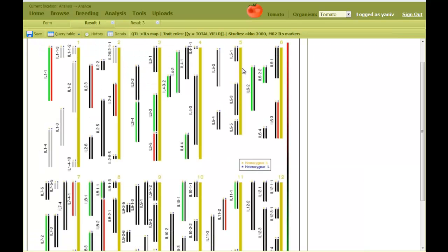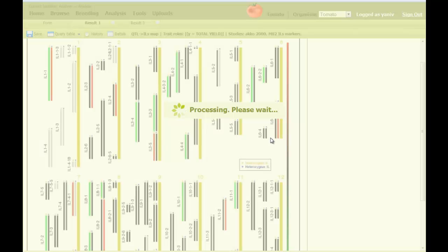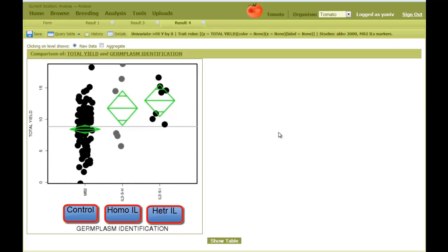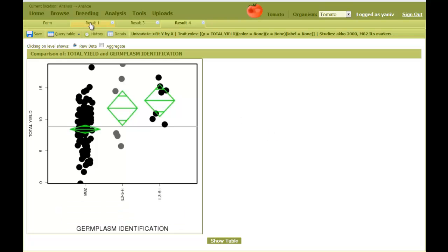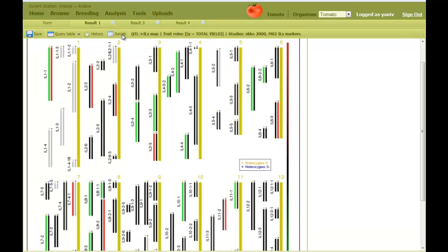Going back to the figure, I can click on the integration name to put the homozygous, heterozygous, and the control on the same figure. Finally, I can click on a chromosome to see all lines that correspond to it.